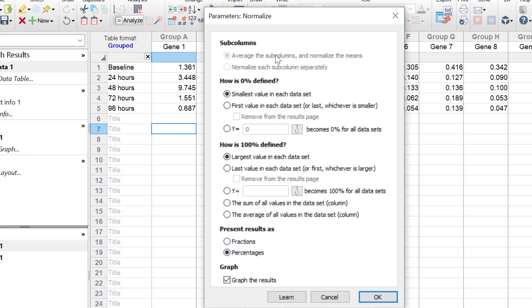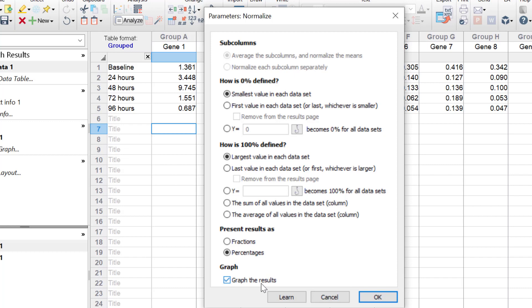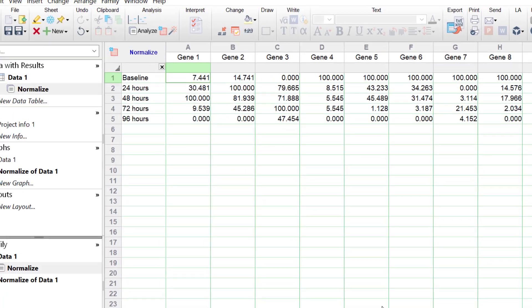So what I want to do is to define 0% as the smallest value in each data set. I also want to define 100% as the largest value in each data set. I want the results to be presented as percentages, and I want to graph the results so that a new graph is created with the normalised data. So I'll ensure that the graph the results option is ticked. I'll click the OK button to run the normalisation.